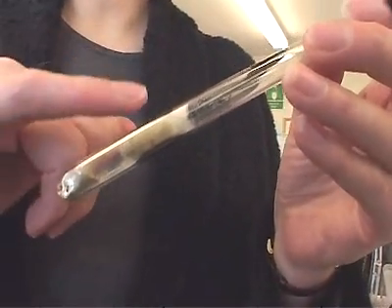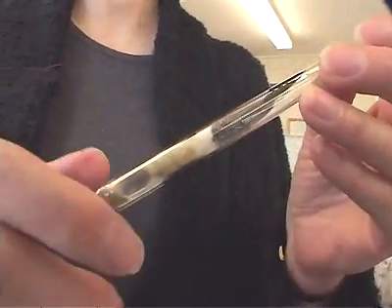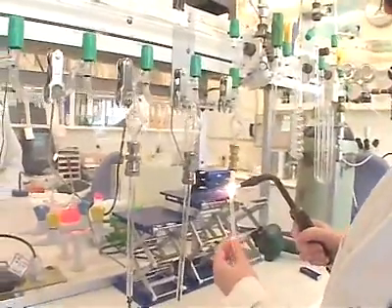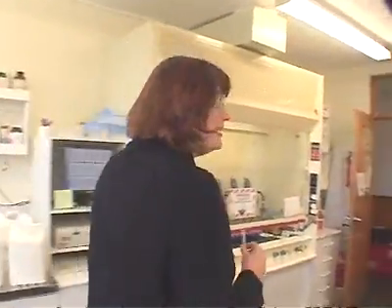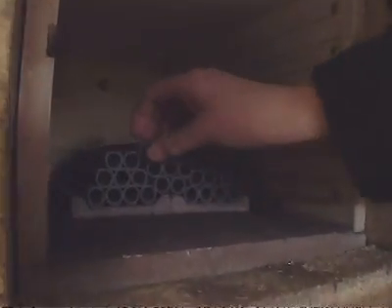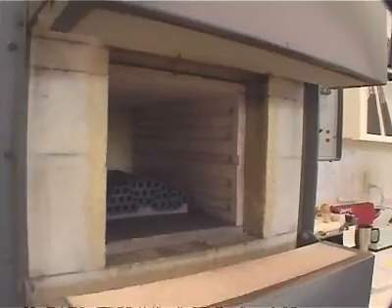In combustion, we place the dried sample in a quartz tube with copper oxide and silver wire, and then we evacuate it so that it's a vacuum inside, and then it's flame sealed to create a tube with a vacuum on the inside. Then that tube is placed into a muffle furnace, and the sample is heated to 900 degrees overnight, and the solid sample then burns in the oxygen, producing carbon dioxide, water, and then sometimes some other non-condensable gases.